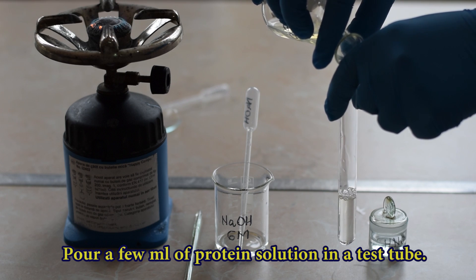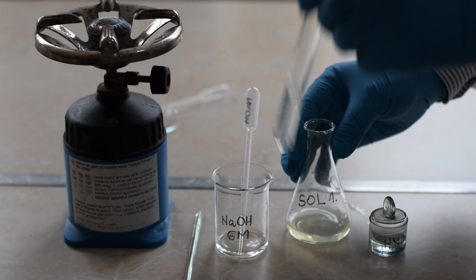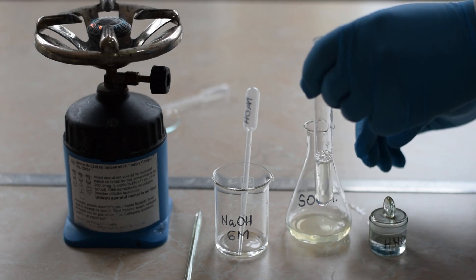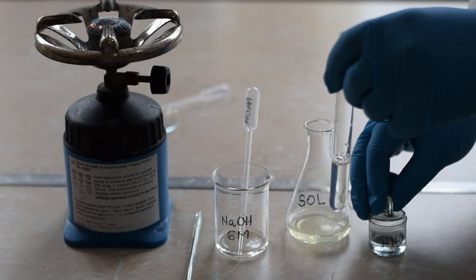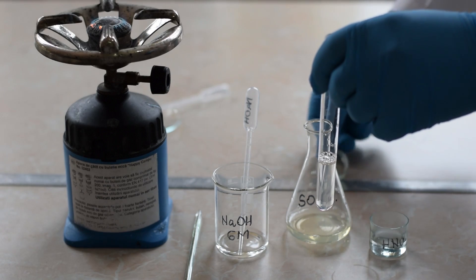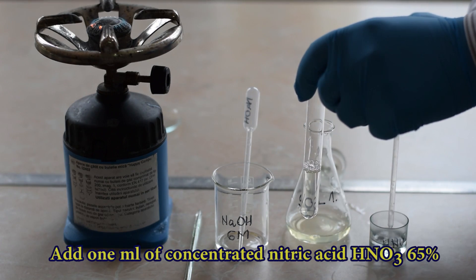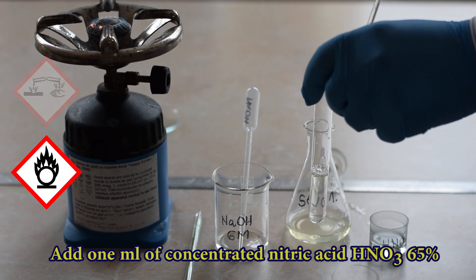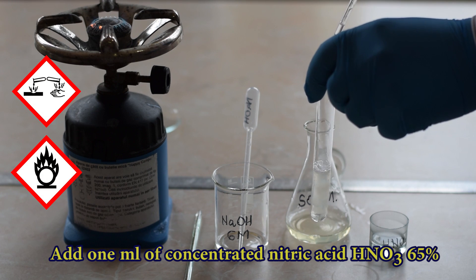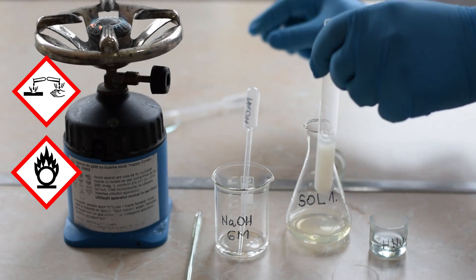To perform the Xanthoproteic test, add in a test tube 5 ml of a protein solution, followed by 2-3 ml of concentrated nitric acid. Handle with great attention the concentrated nitric acid as it is oxidizing and corrosive.